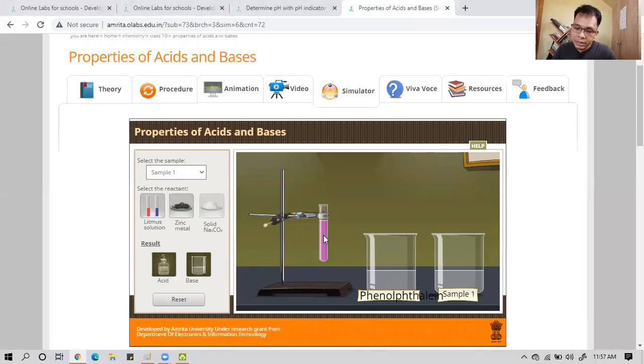If it is an acid, guys, the sample, if we suppose it's an acid, will retain its colorless appearance, because the indicator does not transform into its corresponding base product as it does when you mix it in the base. Okay? So that's how you perform this reaction here. And then, the rest of the samples cannot perform this. But here we go to sample number 2.